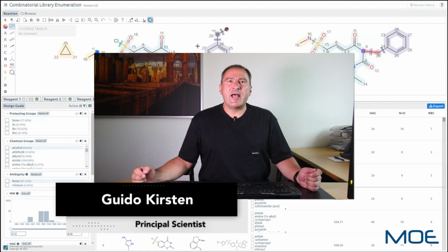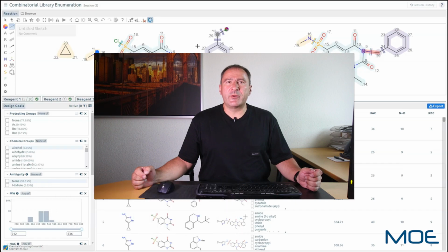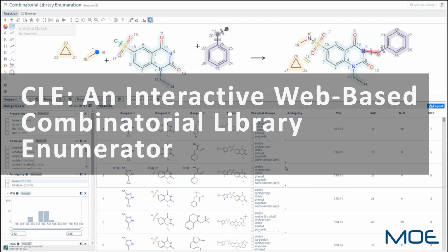In this video, I will show you the Combinatorial Library Enumerator, or CLE. It allows you to sketch and refine reactions in real time, search chemical reagent catalogs on the fly, and apply interactive filters to refine reagent and product lists. Let's see it in action.